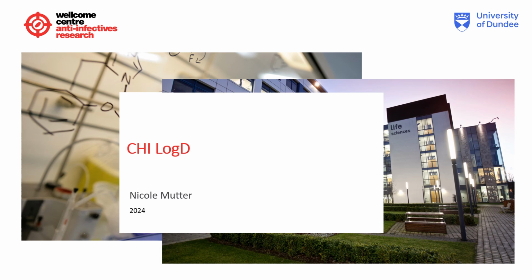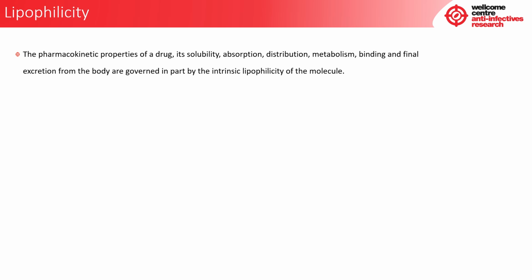This video will go through a step-by-step animation of the LogD method currently in place at the Drug Discovery Unit, University of Dundee. The pharmacokinetic properties of a drug, its solubility, absorption, distribution, metabolism, binding and final excretion from the body are governed in part by the intrinsic lipophilicity of the molecule.